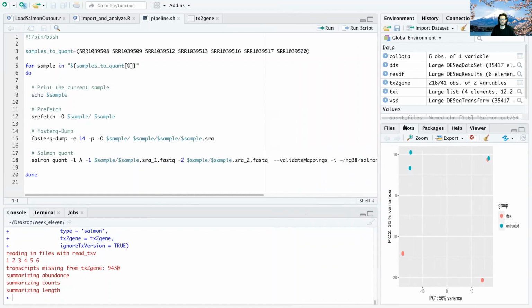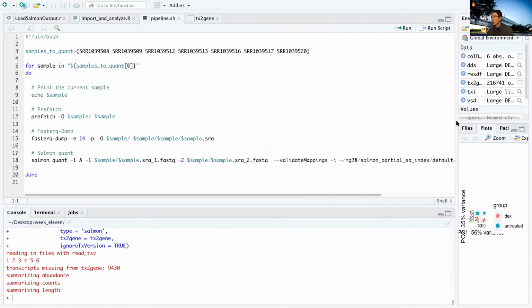So it's pretty much the same code we use to run individual samples, but here it shows how, if you have multiple samples you want to run, you can list all the samples right here. I think Henry just did all the A samples. Here are the samples, and here's a for loop for Linux.